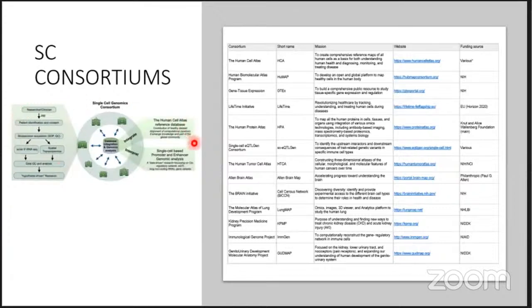These are the technologies where we can achieve this, these are the platforms, these are the academic institutions. They perform single cell sequencing, collect the data from different sources, do the QC, and deposit it. They process and pre-process, and then they take the information from all these kinds of data sets. So now, how can we integrate and generate different kinds of data from the single cell?